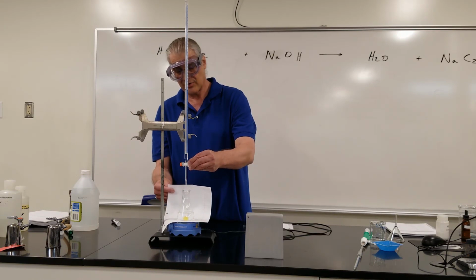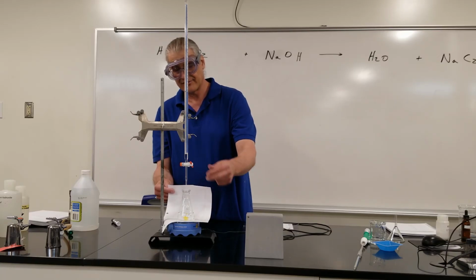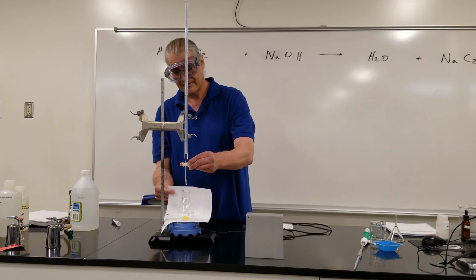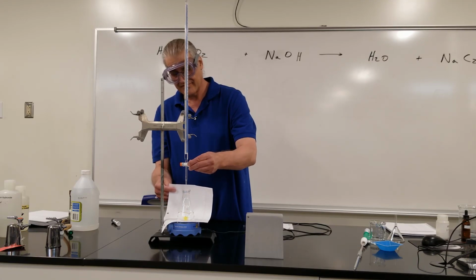And you want to get it to where one drop of the sodium hydroxide makes all the difference between colorless and pink. So, closer and closer. I'm almost there. Some people at this point will use the drop-by-drop method where they just adjust the burette to go one drop at a time.